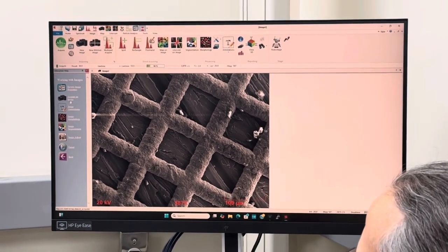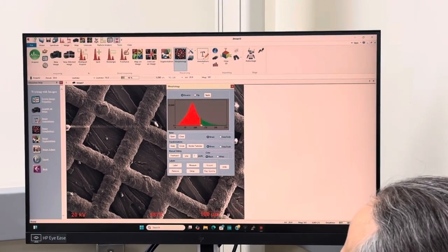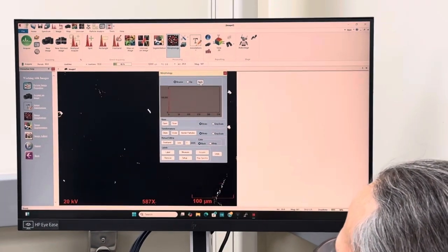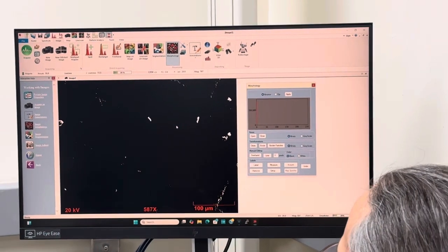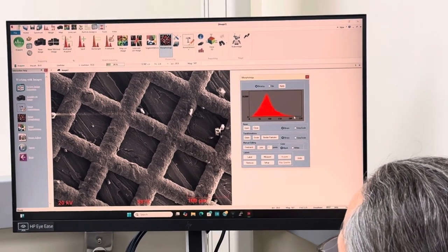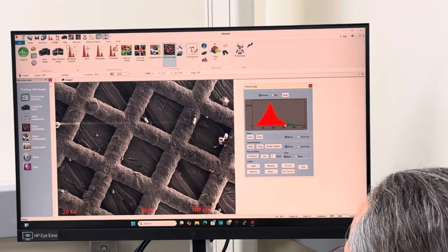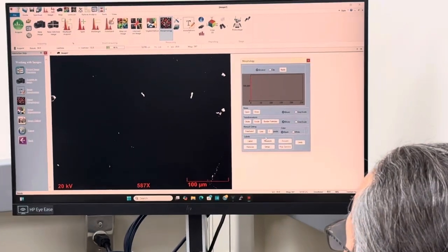We have another feature as we go down the pull downs. We see something that says image morphology. We can click on that. This is a bright and dark histogram, and I can apply this histogram, for instance, and anything it sees in white will think it's a particle. So if I go undo, it brings everything back again. So if I color this graph, undo, and color the graph, apply, then I could erode. I could dilate, bring it back.